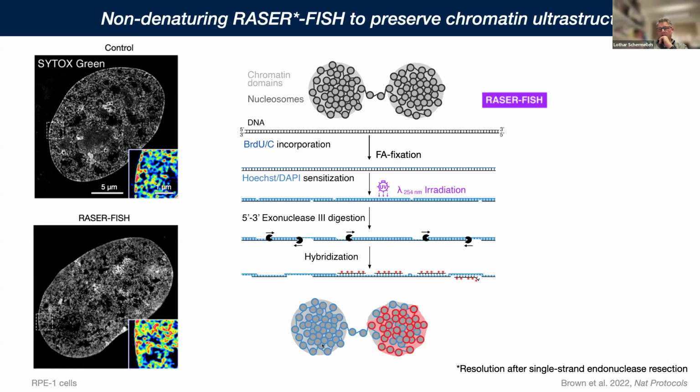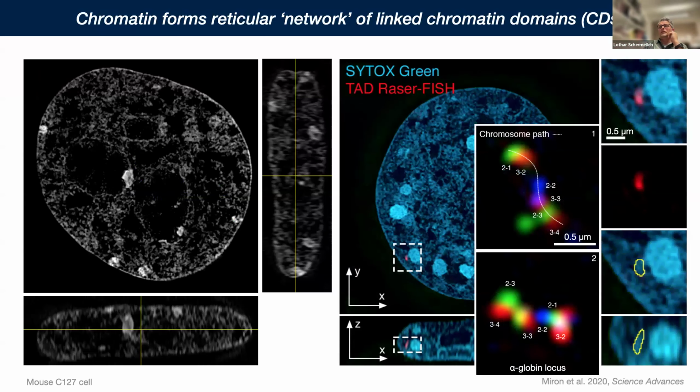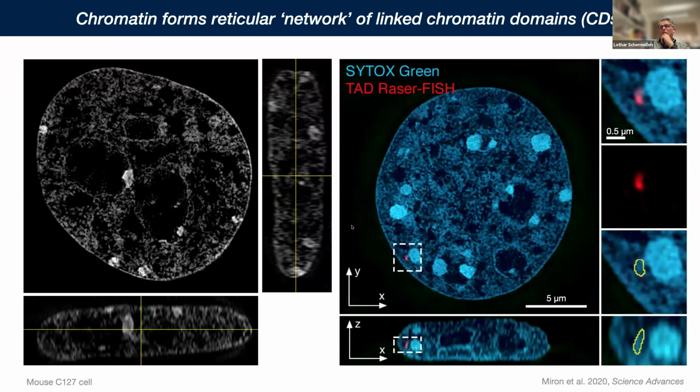In this way, we keep the physical integrity of domains intact, and we keep that nice separation of domains and interchromatin space.